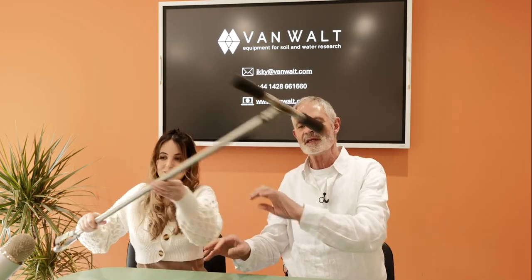So those are the accessories, hand augers, different types. There is one thing that I have forgotten to show you, because it's very small. In some cases where you are dealing with, where can I hold this so you can see it? It's tiny. Just to point out, there are bigger core catchers. This, if I can show you, is a core catcher.